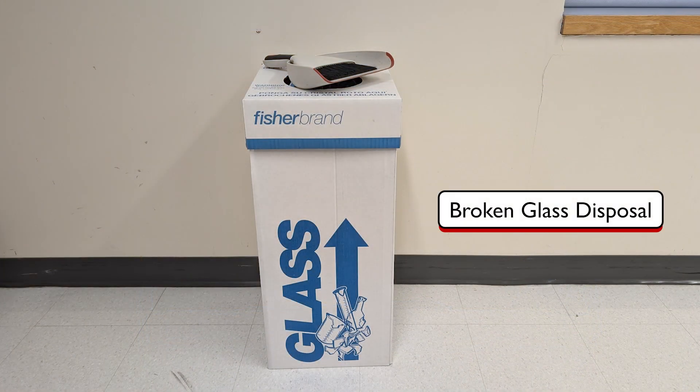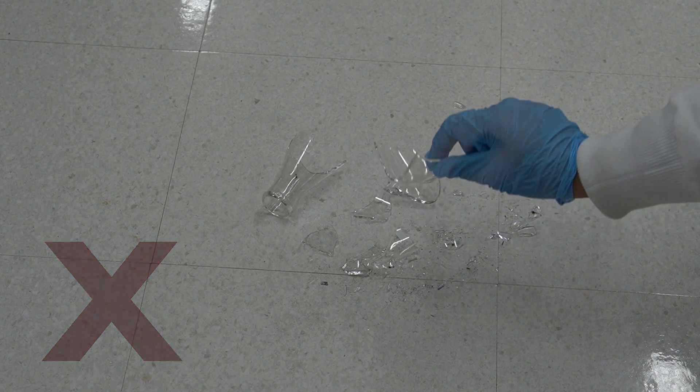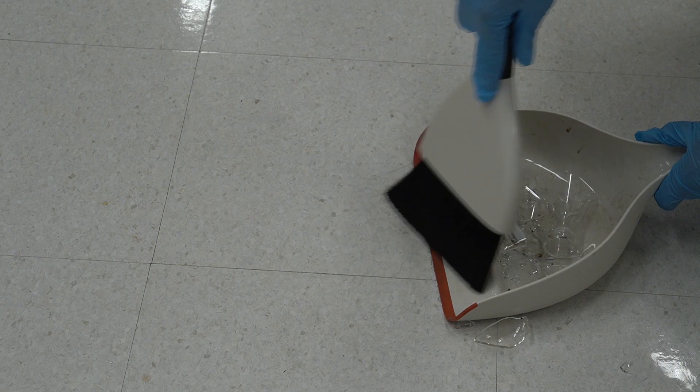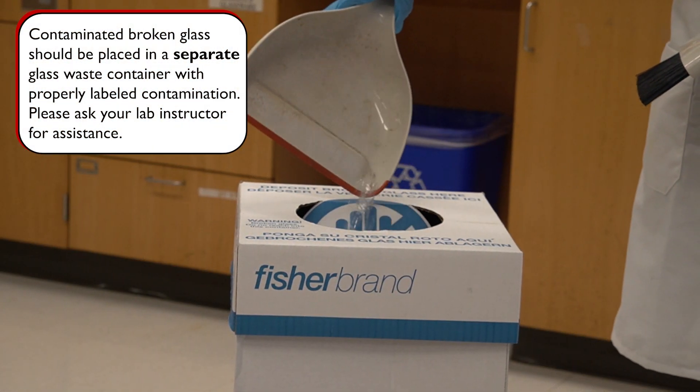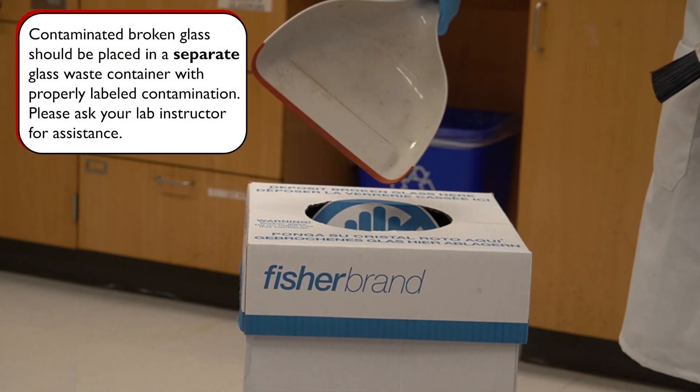The broken glass disposal box is where we put broken glassware. It is important to separate the sharp pieces of glass from other trash so we do not hurt those who handle the waste for us. Two notes about handling broken glass: one, we should never pick up broken glass by hand—use a broom and dustpan. Two, the glass that goes into the disposal box must be clean.